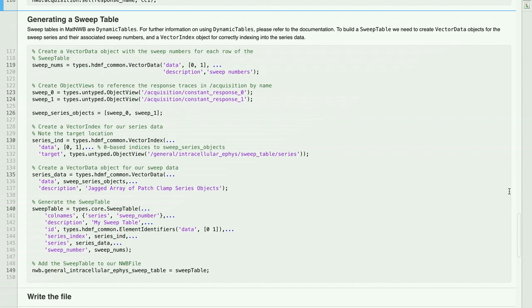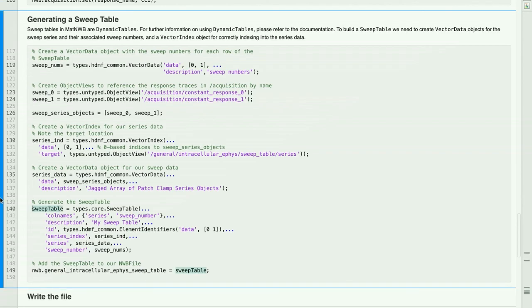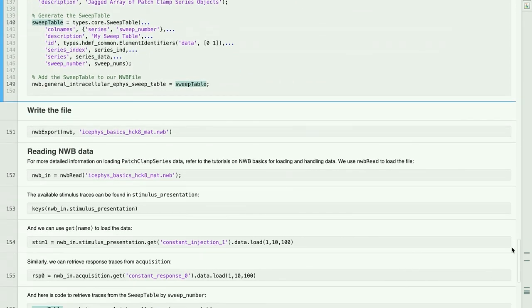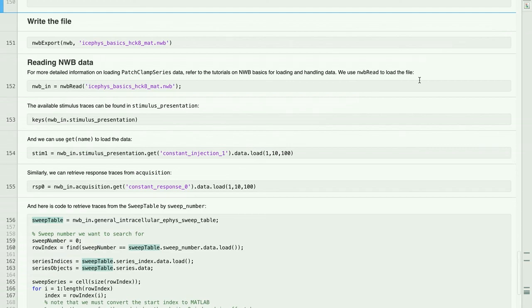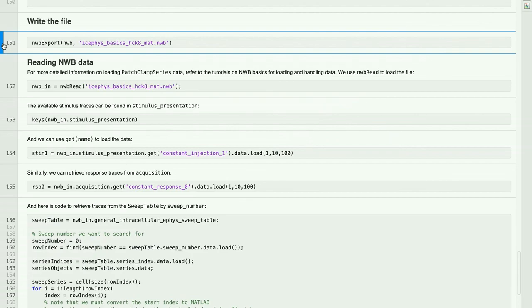For simplicity here, we include example code to create a basic sweep table with the required columns: sweep numbers that contain the associated user-defined sweep numbers, and series that include references to the patch clamp series included in the sweep table. We add this table to our NWB file by assignment to general.intracellular_efiz.sweep_table. Once we've added all the data, we can write it to file using NWBExport. To inspect our work, we can then read the file we just created back into MATLAB using NWBRead.